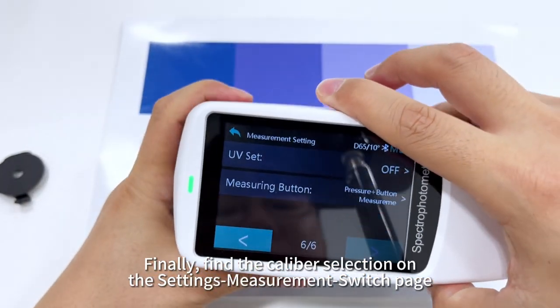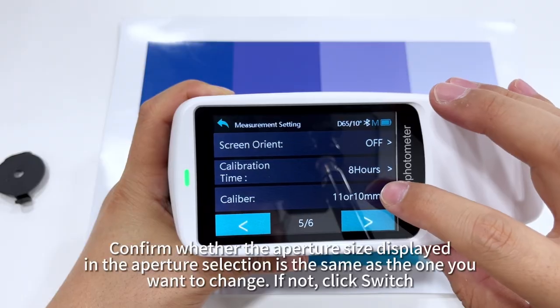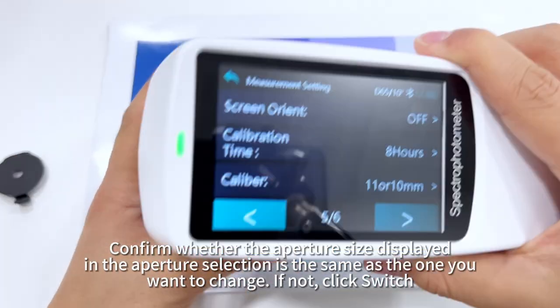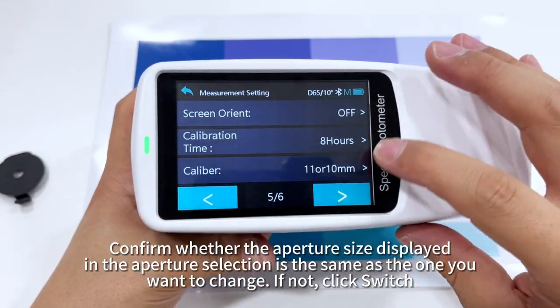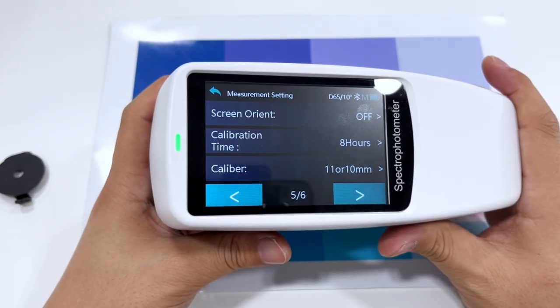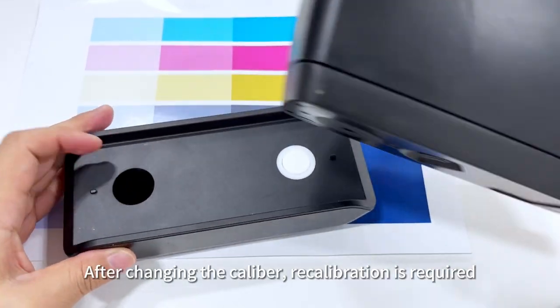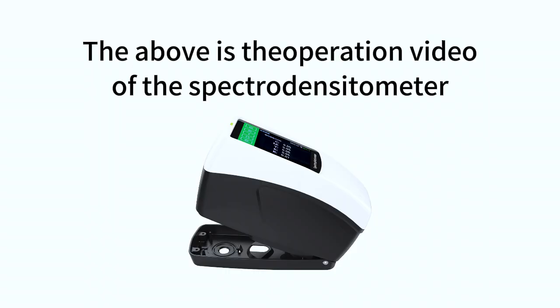Finally, find the caliber selection on the Settings, Measurement switch page. Confirm whether the aperture size displayed in the aperture selection is the same as the one you want to change. If not, click Switch. After changing the caliber, recalibration is required. The above is the operation video of the spectral densitometer.